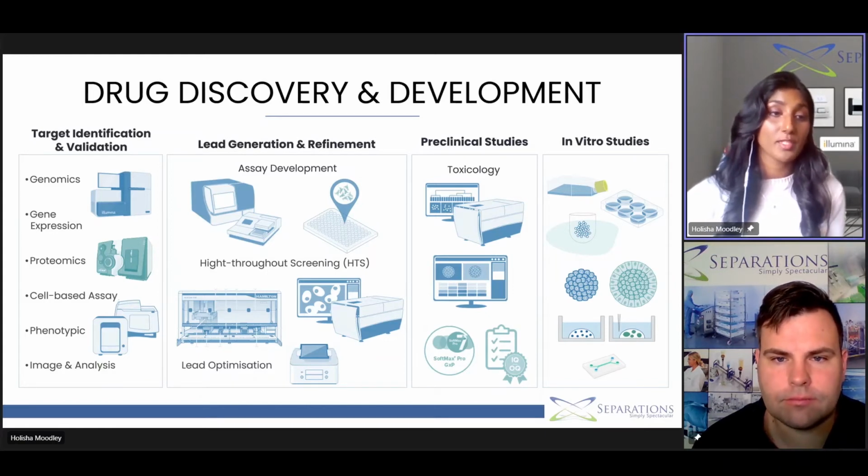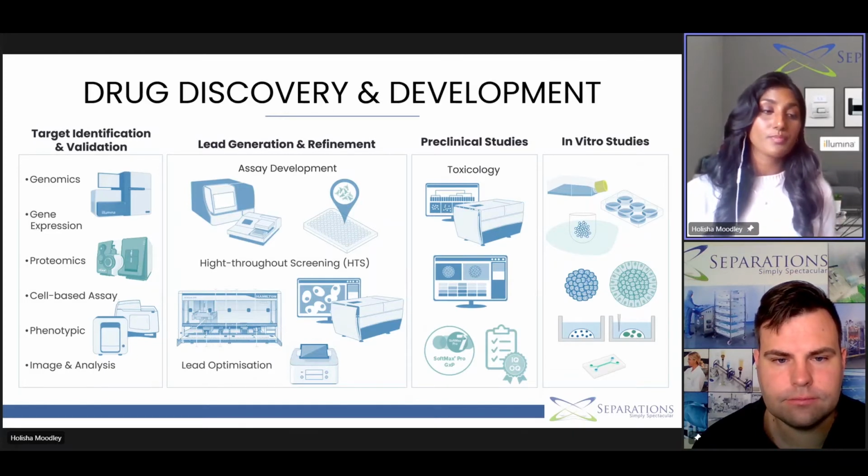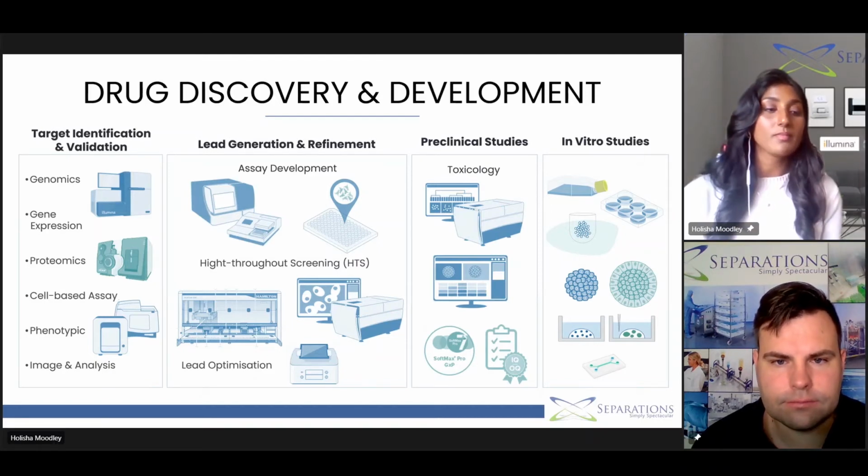One way we can do lead optimization is through high throughput screening. High throughput screening is testing this compound library against a biological target. Screening can involve replicating thousands of biochemical reactions to test for 100,000 drug compound targets. We do this systematically using a wide range of concentrations.